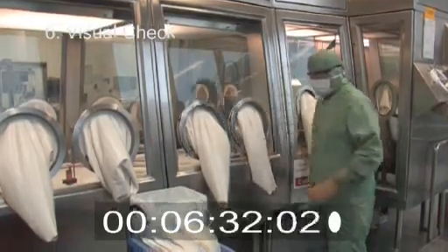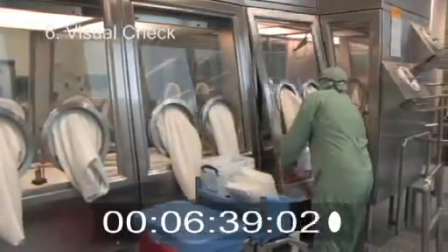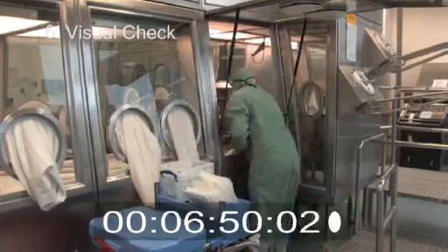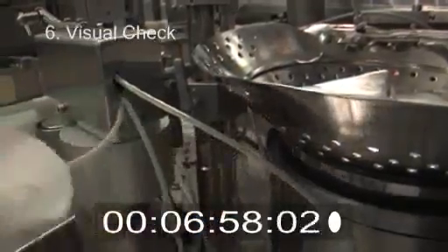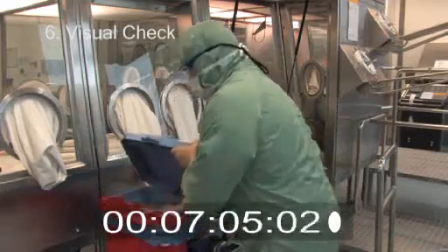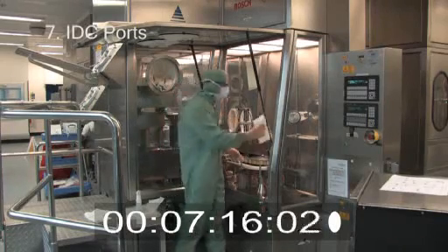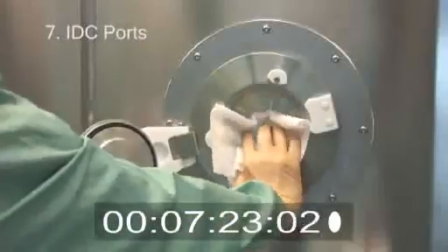Here the operator has spotted an area that is still dirty and was missed during the clean, or was not wiped sufficiently to remove all residues. The training for each isolator will identify these hot spots, though it is imperative that the isolator is thoroughly checked to ensure it is cleaned prior to the VHP sanitisation cycle. Should any isolator fail the visual check, it must be thoroughly recleaned again until all signs of dirt and residue are removed. Just prior to VHP, the IDC port doors need to have blanks inserted to allow for the VHP cycle to be performed, with the doors open, thus enabling all relevant surfaces to be sanitised.